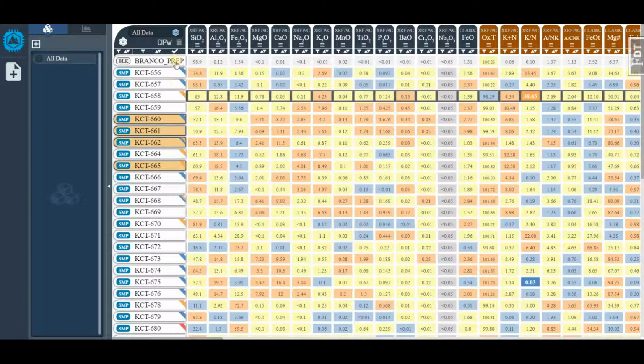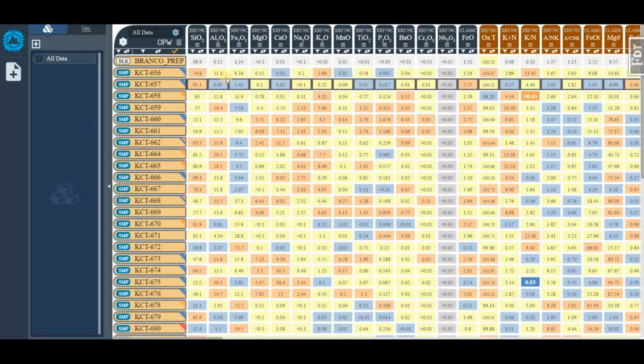To select all the samples, click here. Click again to remove the selection.